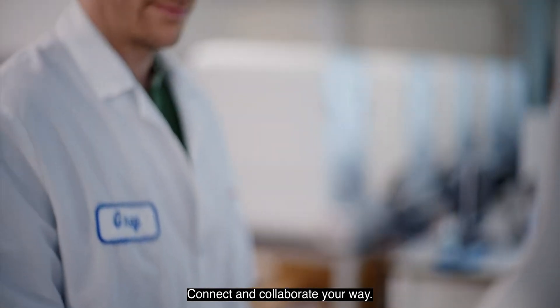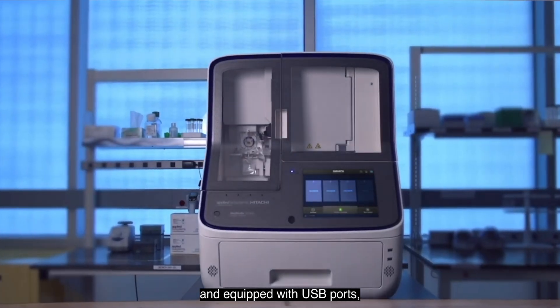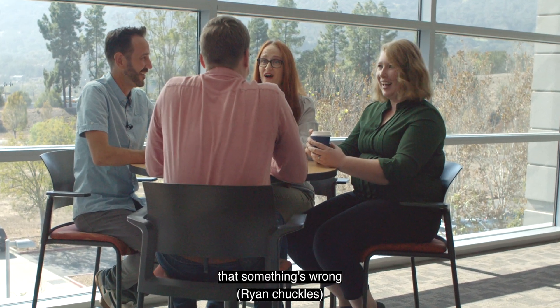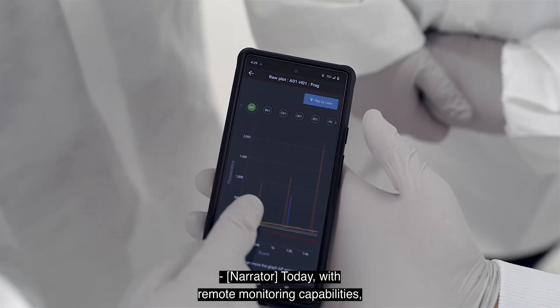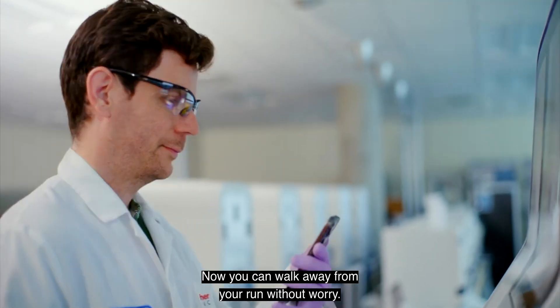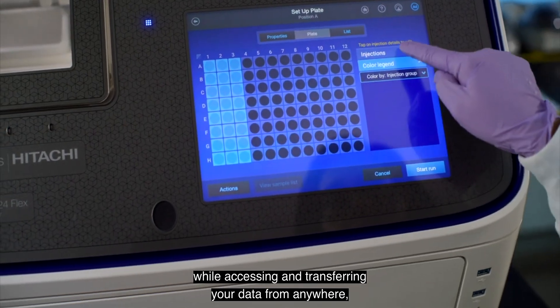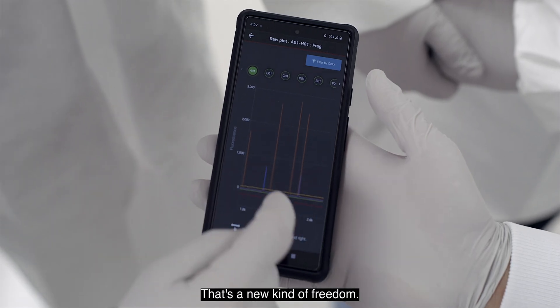Connect and collaborate your way. Wi-Fi capable, LIMS compatible, and equipped with USB ports, the SeekStudioFlex system can connect to your local area network. Can this instrument tell us at our desk that something's wrong so we can pop in there and fix it? Today, with remote monitoring capabilities, what was once impossible is now a reality. Now you can walk away from your run without worry — remotely monitor your run securely while accessing and transferring your data from anywhere: your instrument, your desktop, your laptop, or your mobile device. That's a new kind of freedom.